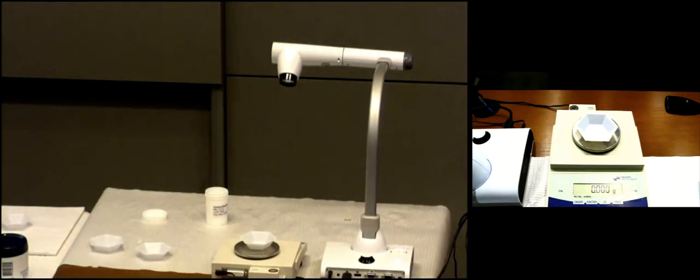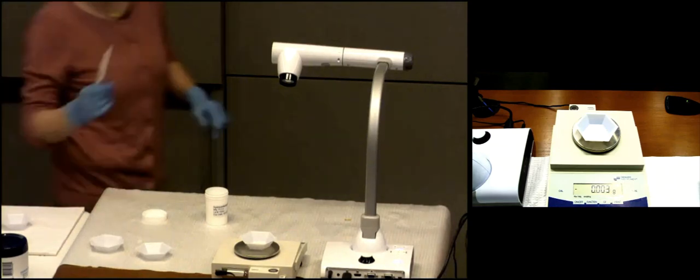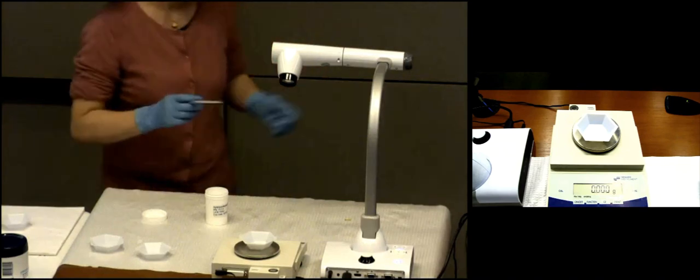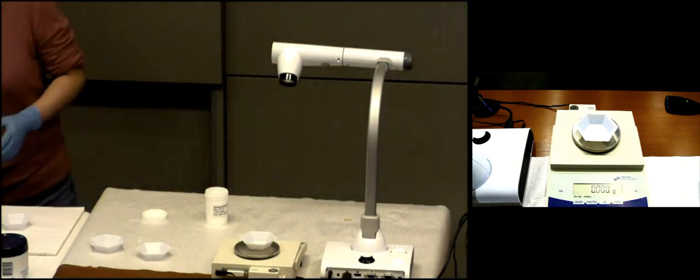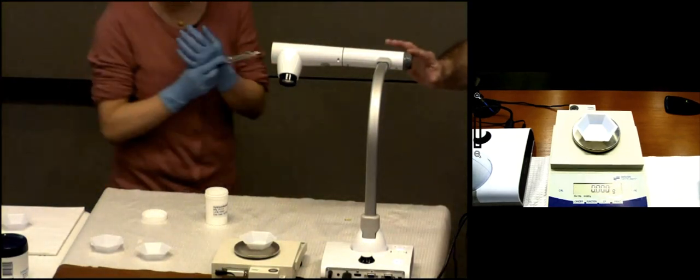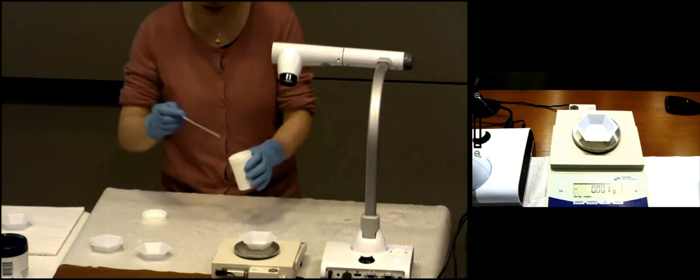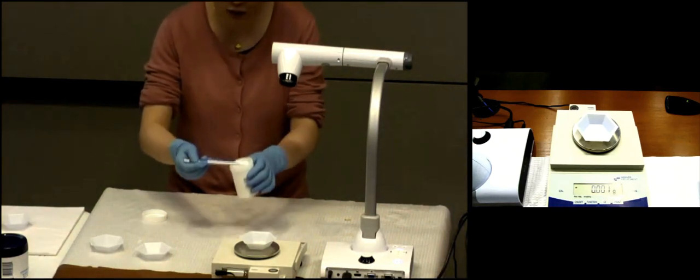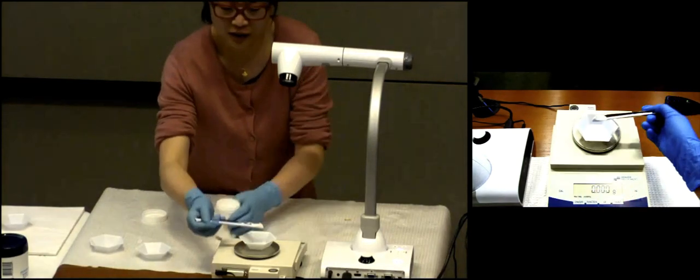All right. Soon you will know why I need this tissue box. This is one dosage form where you can probably need your tissue box a lot. All right, so let's do a few measurements. Let's start with hydrocortisone. What is my target weight, by the way?